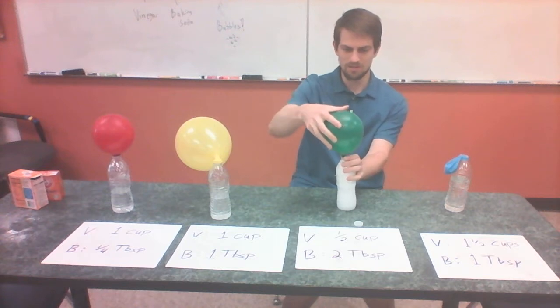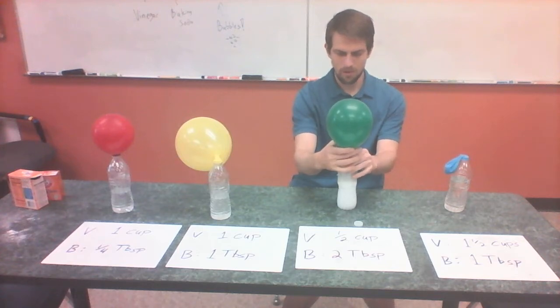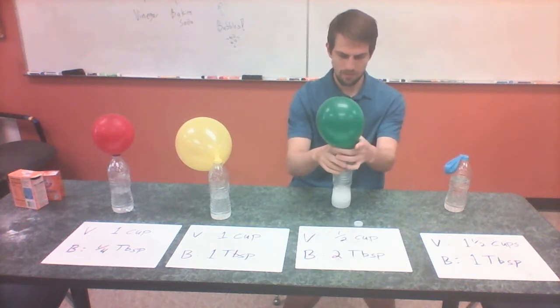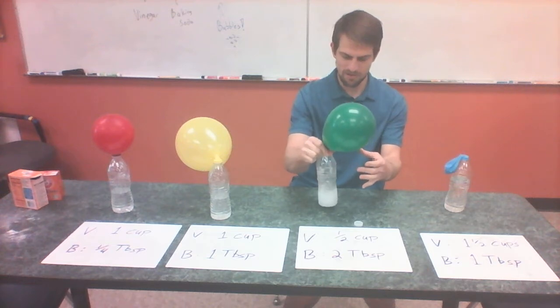Well, it looks like it's coming up into the balloon again. So we're getting lots of reaction happening. But it's starting to slow down a little bit. I don't know if it's going to catch up to the yellow one over there. So let's see what happens. Swirl, make sure it gets all reacted.